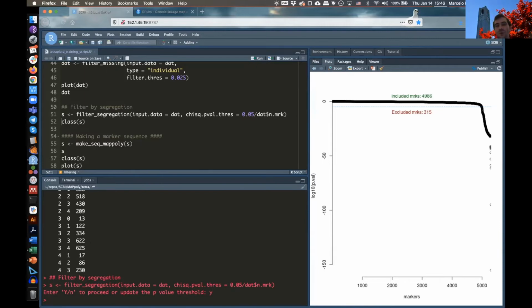Again, the algorithms here, as you see, are very robust. So if you want to be more or less stringent in this filtering process, it's okay. But if you have less information, or if you let the program deal with less informative markers, it will take more time because it will rely more on the hidden Markov side of the algorithm, which is more intense.